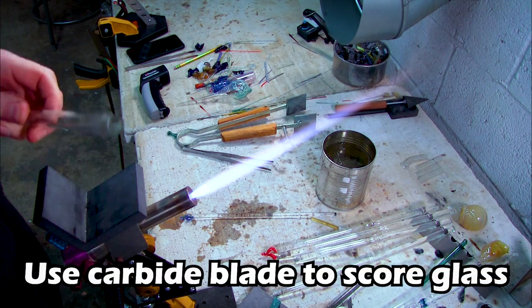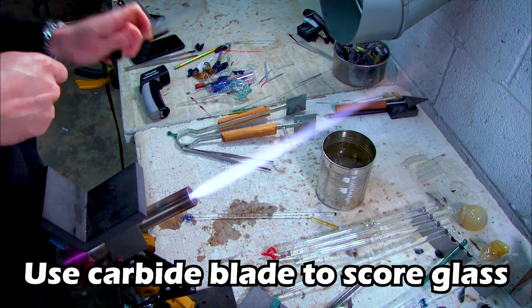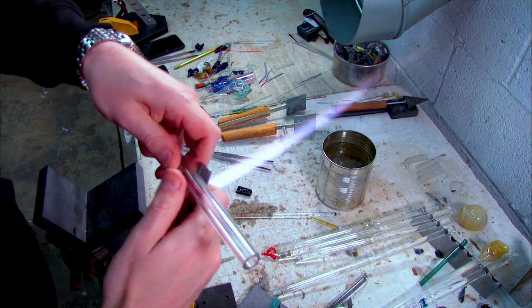I'm not going to do much talking in this video, so I've included handy captions to walk you through the test tube making process.